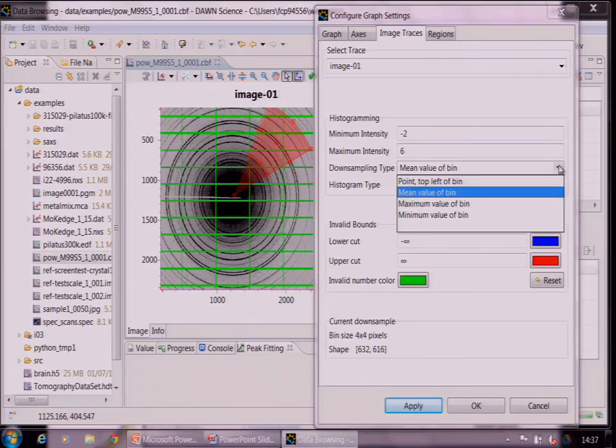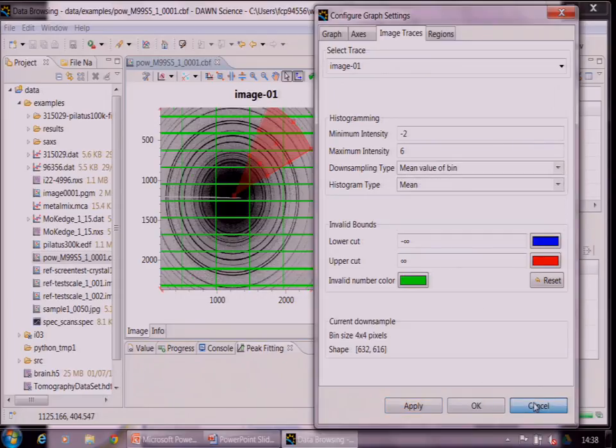We're going to run out of time, by the way, because we're in the first demo and I've got about five minutes. But you've got different ideas of downsampling. You can take a bucket which is say 8 by 8 or 4 by 4, and that's got to fit on one screen pixel. Then you decide, for that bucket, what the value of the pixel shown to the user is, and that kind of stuff. We haven't used APIs for that. We've just coded it.